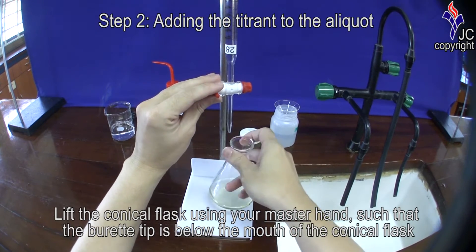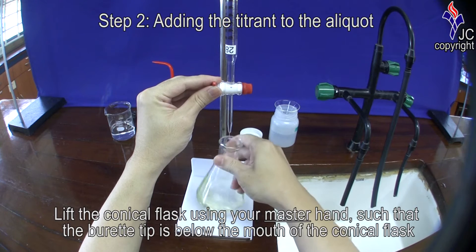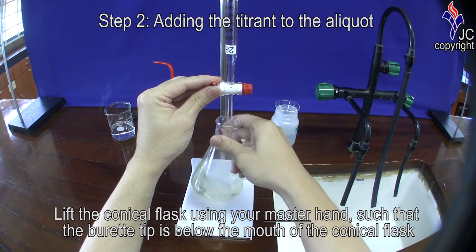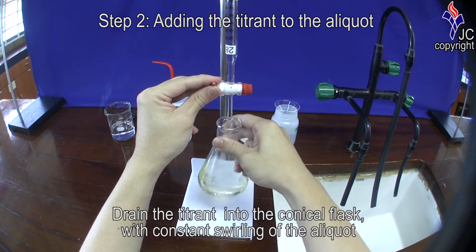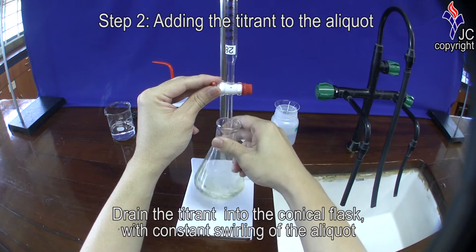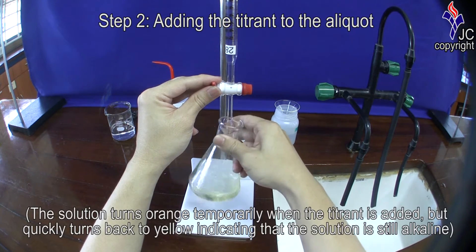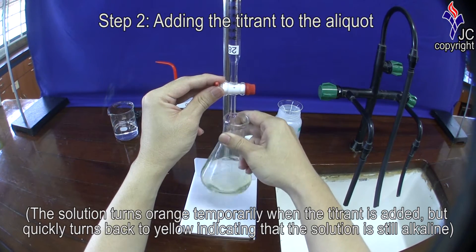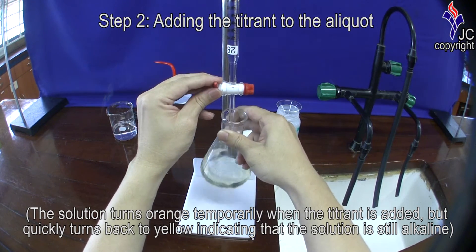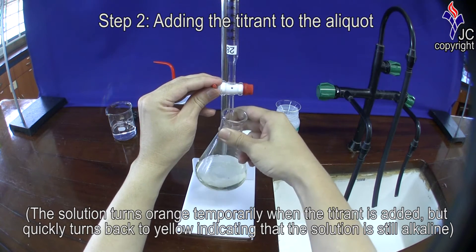Lift the conical flask up using your master hand such that the burette tip is inside the mouth of the conical flask. Drain the titrant into the conical flask with constant swirling of the aliquot. Note that the colour of the solution turns red or orange temporarily when the titrant is added, but quickly turns back to yellow, indicating that the solution is still alkaline.